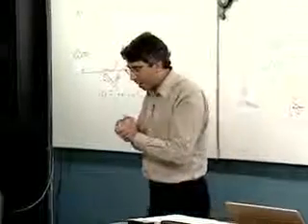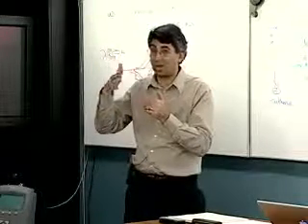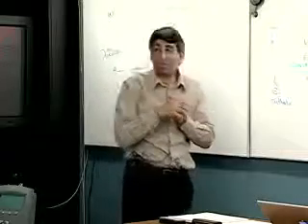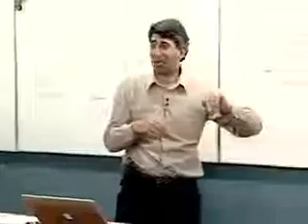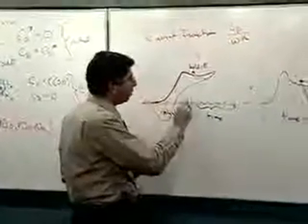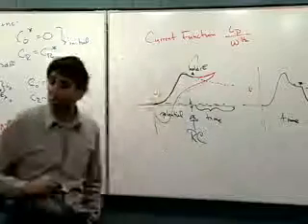The other thing that can happen, in particular if you have either not a lot of electroactive species around or one where the rate constants aren't so fast, is that the peaks can start to dissolve into the baseline. And again, if you have a reasonable amount of resistance in your system, then the baseline, instead of being a flat line like we'd like to think it is, we can get some thickness to that. And that thickness is due to the RC constant of the system.